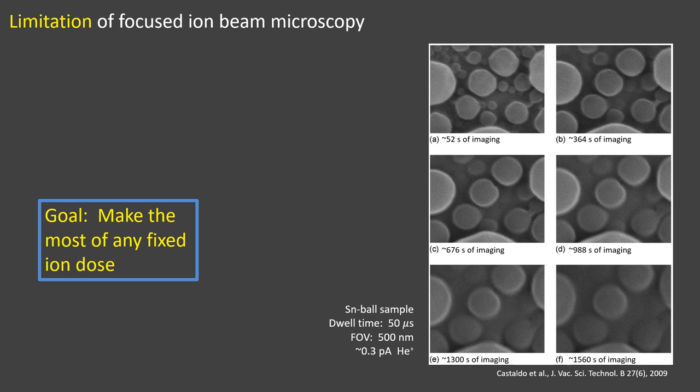There are some limitations of the microscopy. Because the ions are very heavy, they cause damage to the sample, especially at long scan times. As time increases, we can see that some small features in the red and blue boxes disappear. Our goal here is to make the most of any fixed ion dose. Doing so will equivalently allow us to reduce ion dose for any desired image quality.